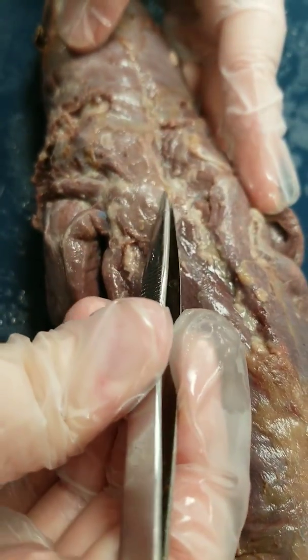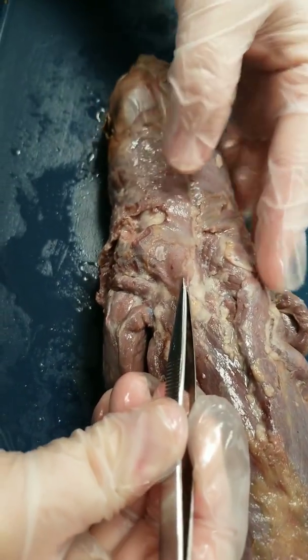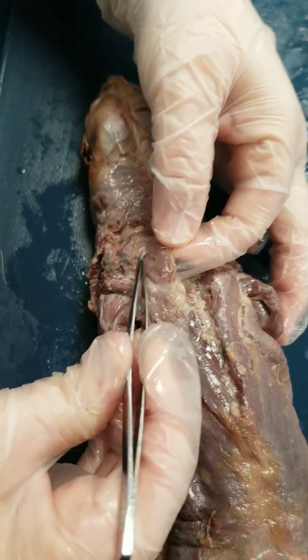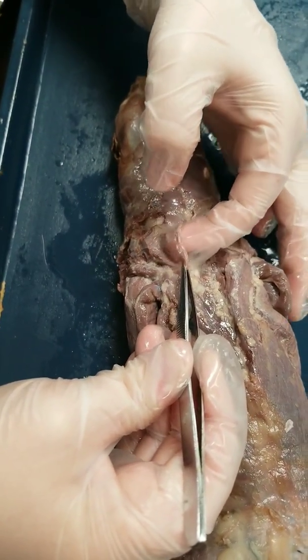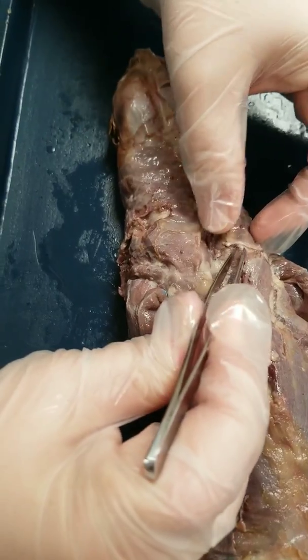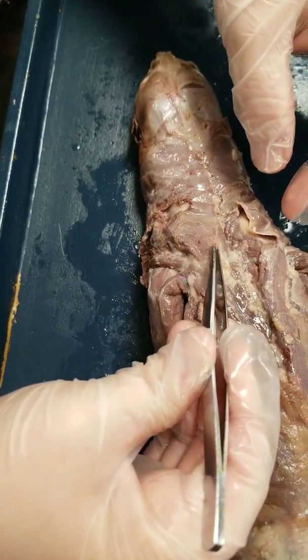This muscle over the scapula towards the center of the back is the acromiotrapezius muscle. This is a really thin muscle, almost as thin as the obliques, so you want to be careful with this one. You can have it separated here — I've separated the one on the other side as well. This is the acromiotrapezius muscle.